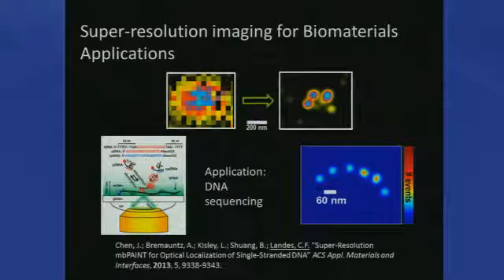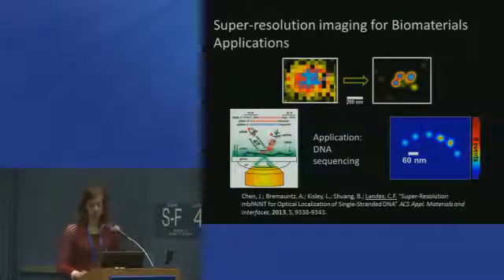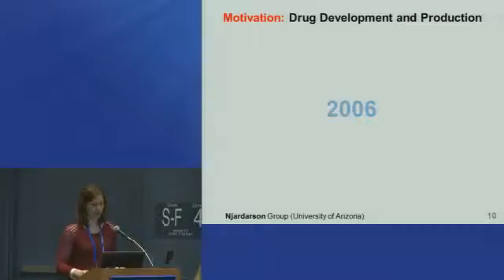And then additionally, you'd like to be able to resolve interactions between your analyte and the adsorbent at a resolution approaching the size of the analyte. And so we've done some development of super resolution methods to image biomedical and biomaterials applications. That's the piece that relates most closely to what I'm going to tell you about today.